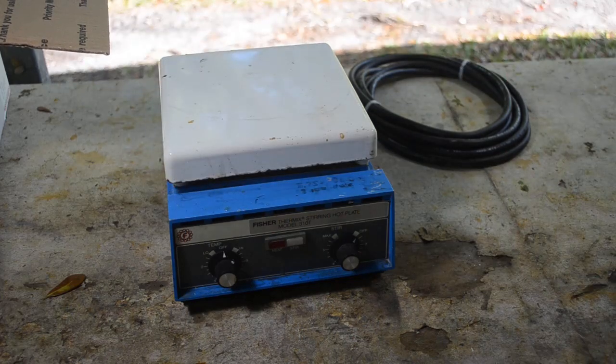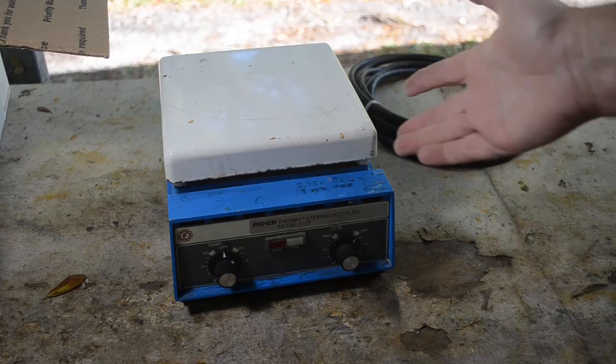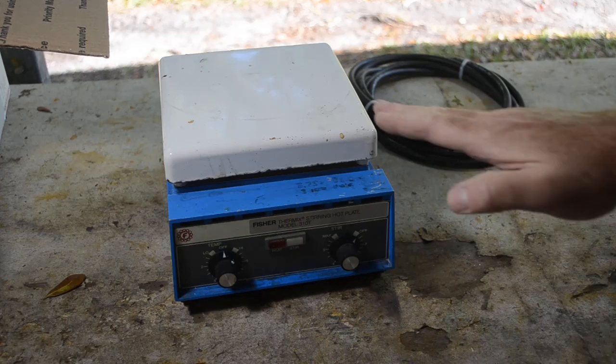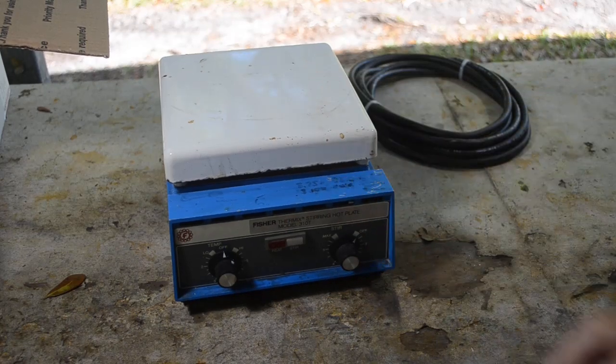I released a video not too long ago about commonly asked viewer questions, and one of them is: why don't I use a stir plate? Well, because the environment inside the fume hood is very harsh on metallic stuff. I go through hot plates like crazy — they don't last me very long, maybe six months or so. I wasn't willing to spend a lot of money on an expensive hot plate stir plate just to have it rotted away in maybe six months by the fumes in there. So we'll see how long this one lasts. I got it cheap because it's used.